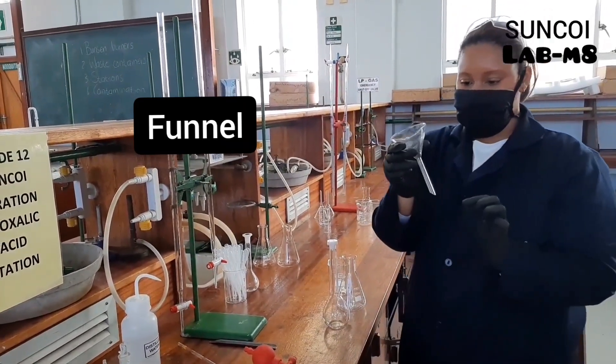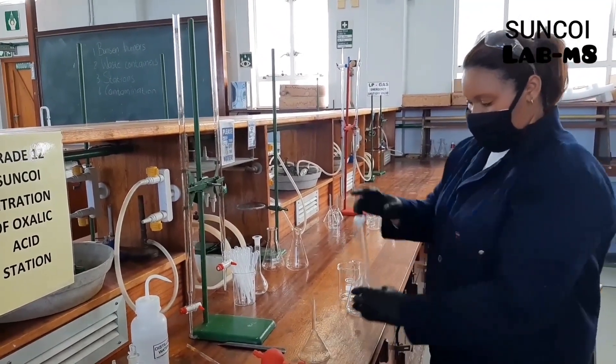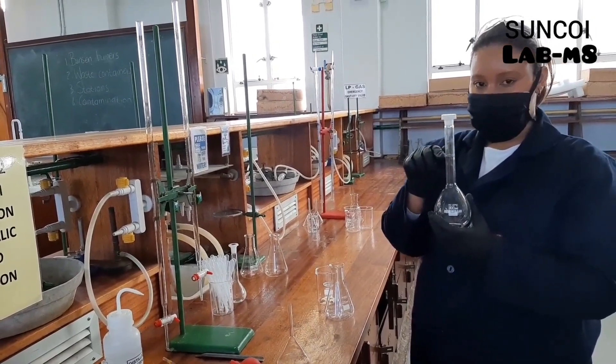This is a glass funnel. We use this in our titrations to pour through. This one is a volumetric flask. We use this to accurately determine concentrations by using the marked line.